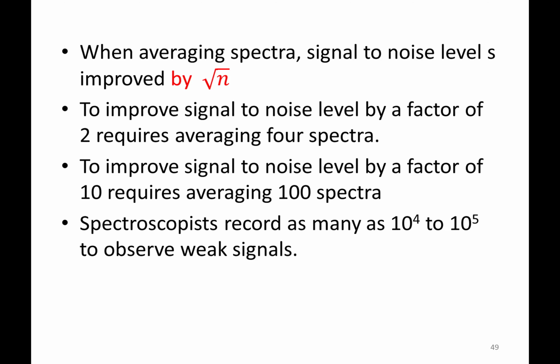So we are lucky, we know instruments, you can digitize them, let them run, okay? The problem is you spend time, and time is money, okay? That's the kind of thing we're talking about. Typically, notice what we do in spectroscopy: NMR, infrared, UV-vis, fluorescence, and so forth. You acquire as many as 10 to the 4th or 10 to the 5th scans to observe very weak signals. This is a result of that consequence, okay?